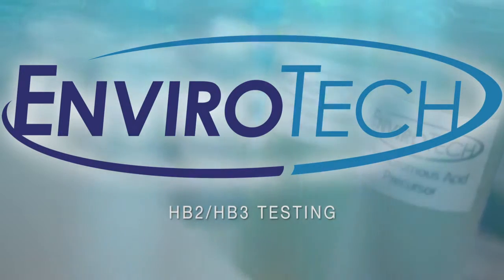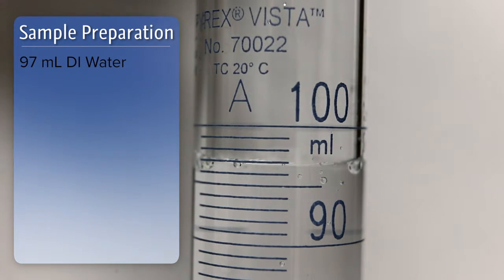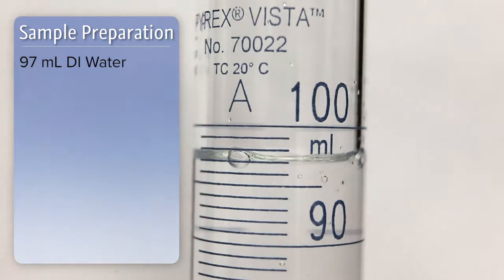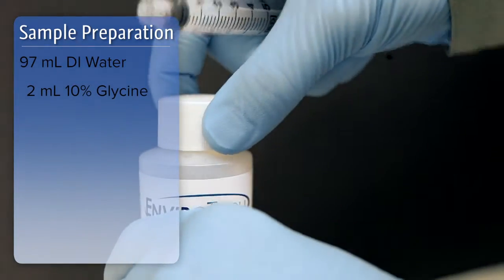Analysis. We'll start with 97 millilitres of deionized water. Two mils of glycine solution, 10%.